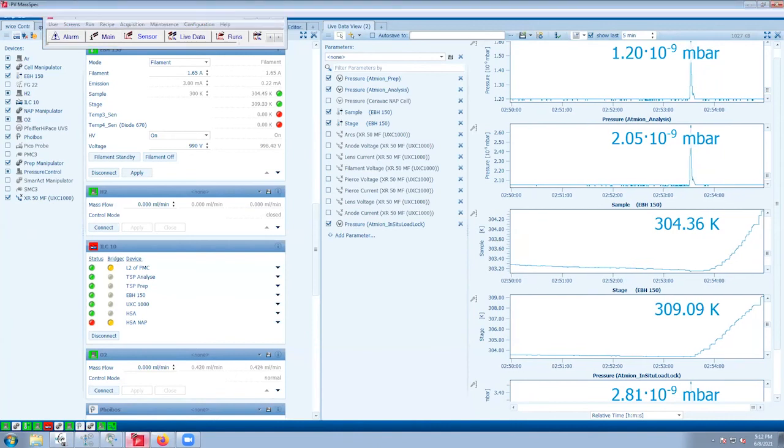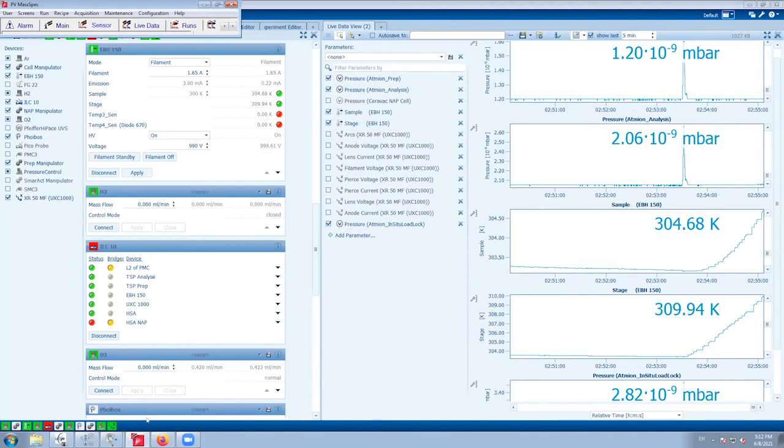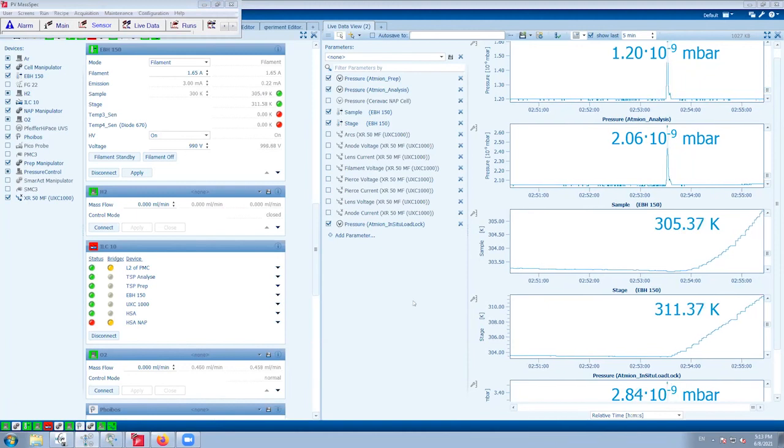With such ceramics, you cannot go too high. I think the highest is 250 degrees C. Also, the speed of heating is, I think, much slower. You should increase the temperature very slowly, because as soon as you increase it a bit faster, this ceramic is very easy to break. I worked once with such a system, and it was really hard to increase the current.